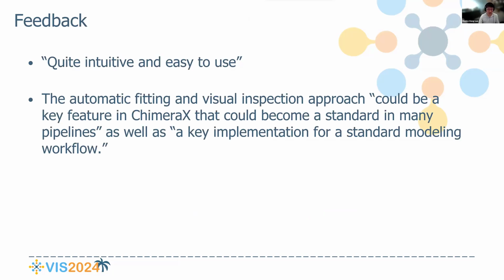One user expressed that DiffFit is quite intuitive and easy to use. The other mentioned the automatic fitting and visual inspection approach could be a key feature in ChimeraX that could become a standard in many pipelines, as well as a key implementation for a standard modeling workflow.